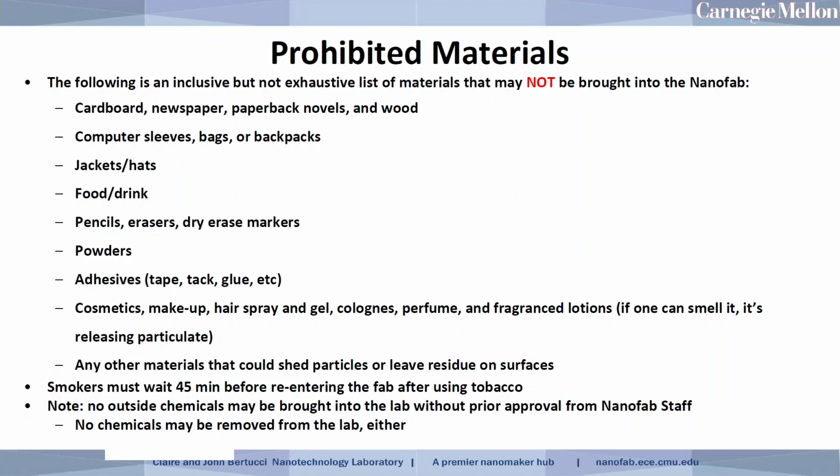Any type of powder should not be brought into the clean room. Anything like nanoparticle solutions kind of falls into this category as well, because if they are dehydrated, they can turn into powders and thus be a particle risk. You also want to avoid the use of any adhesives like tape, tack, or glue, because these types of materials tend to leave a sticky residue behind.